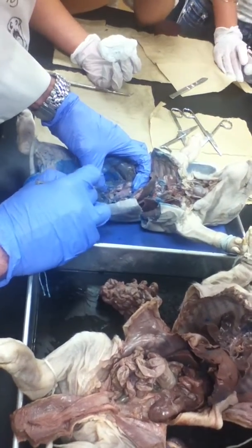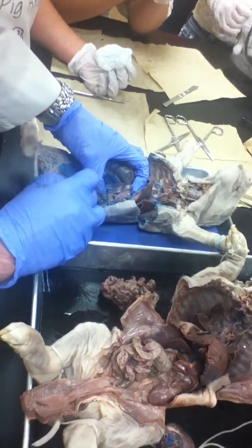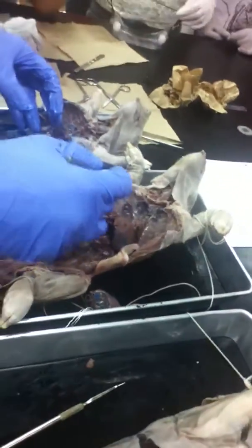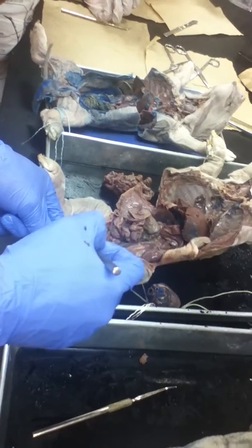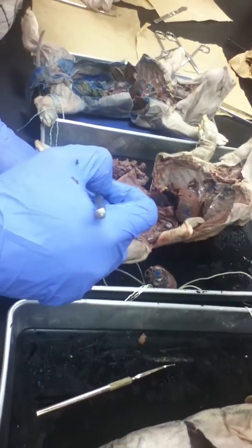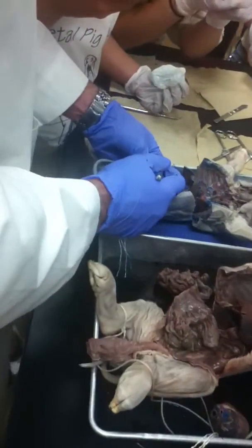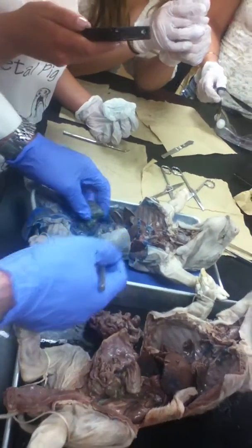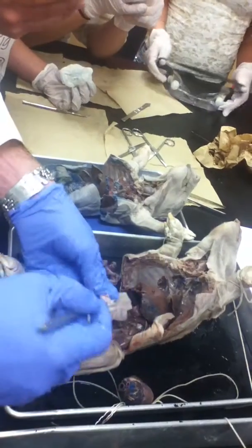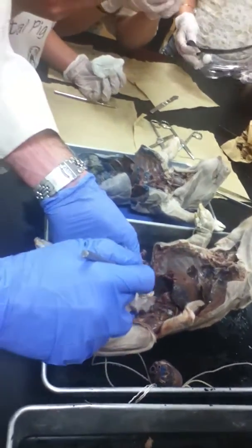Pancreas is this spongy looking material in here. Where are we at here? Urinary bladder is right in the center here, right between the umbilical arteries. The cecum, this chub here, we'll use this one. This chub that looks all spirally, that's the cecum. The umbilical cord is right there, with the umbilical arteries and veins coming out of it.